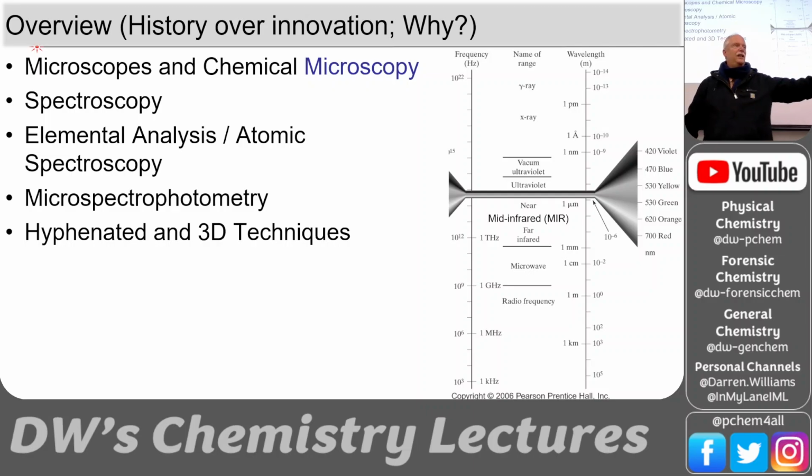We know these techniques are tried and true, and we have a lot of good training on how to identify certain kinds of plants, certain kinds of objects. There's microcrystalline tests we can do on certain drugs and so on. They react with certain reagents and make certain shaped crystals, and we're like, yes, absolutely, that's cocaine. So there's a microcrystalline test for cocaine. Put it with a reagent, it produces crystals of a certain shape. You look under the microscope, there you go.